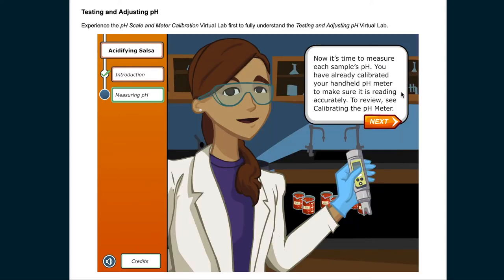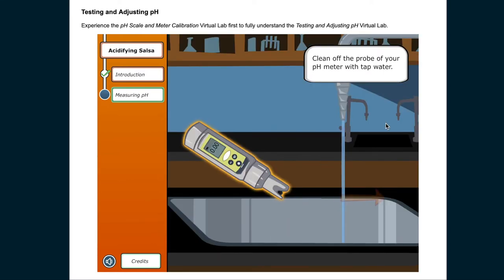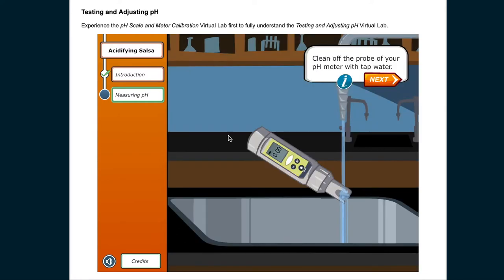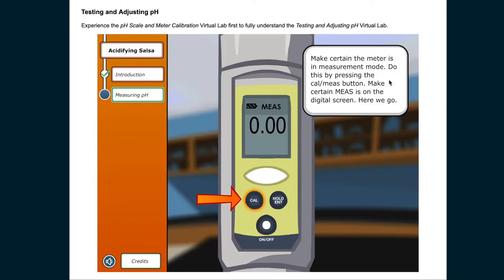Now it's time to measure each sample's pH. You have already calibrated your handheld pH meter to make sure it is reading accurately. To review, see calibrating the pH meter. Clean off the probe of your pH meter with tap water. Remember, some meters require distilled or deionized water. Make certain the meter is in measurement mode. Do this by pressing the CALMES button. Make certain MEAS is on the digital screen.